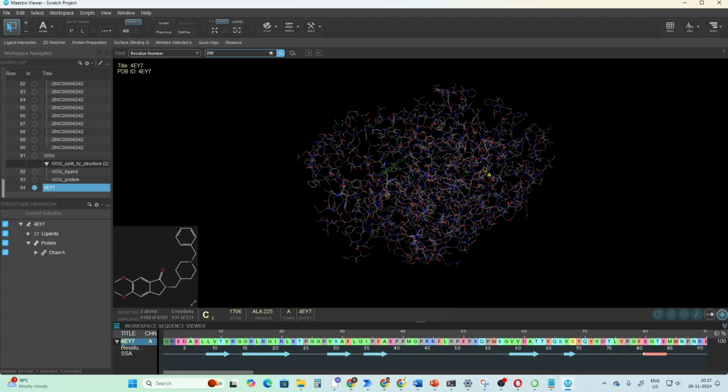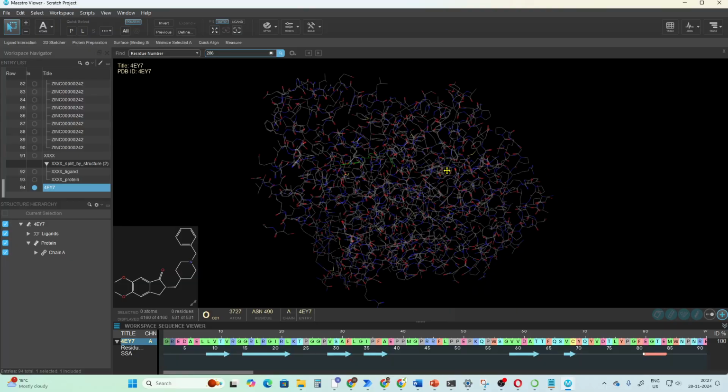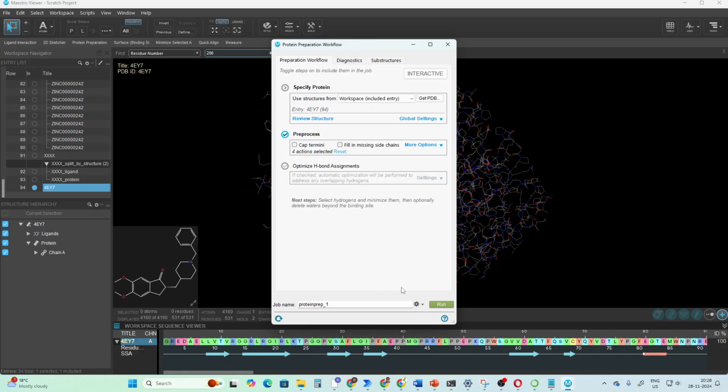All right, so we have cleaned the structure. And then if you go to this protein preparation wizard, let's uncheck this. If you have a license, then you can keep this, okay? But we don't have a license, so we are going to uncheck all of this. Others you can keep as default. And then press run.